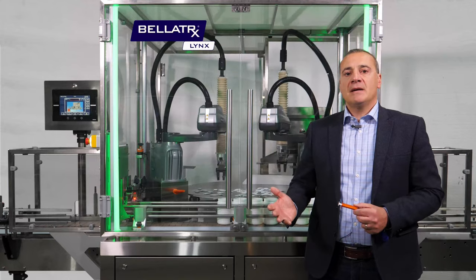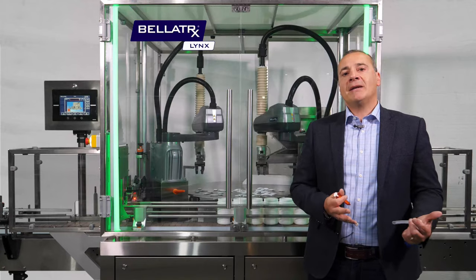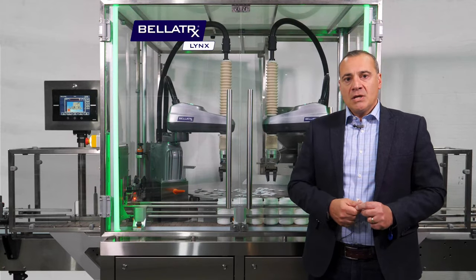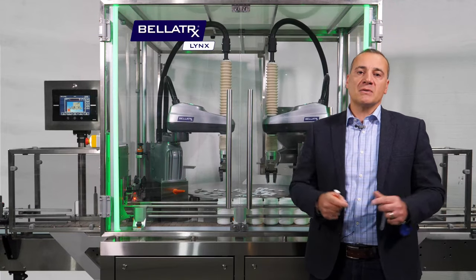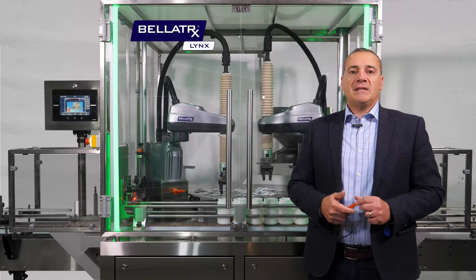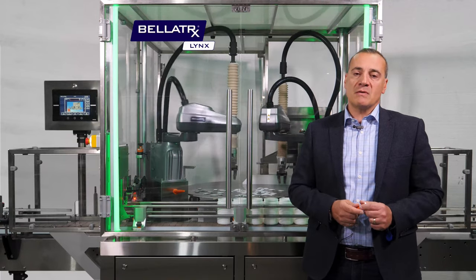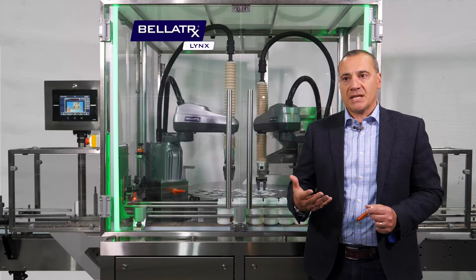Typically this is done either at high speed with high automation and a very high degree of complexity, or manual inserting using operators. Today we're going to talk about three major factors that make the LINX unique compared to other solutions on the market. The first one is flexibility of formats. The LINX is a robotic machine that allows us to feed desiccants of different shapes and sizes with almost no changeover — end of line tooling would be the only thing that changes, plus a different recipe selection.